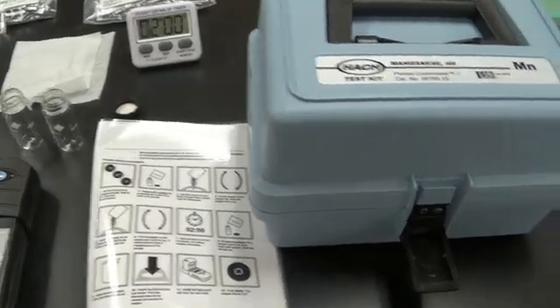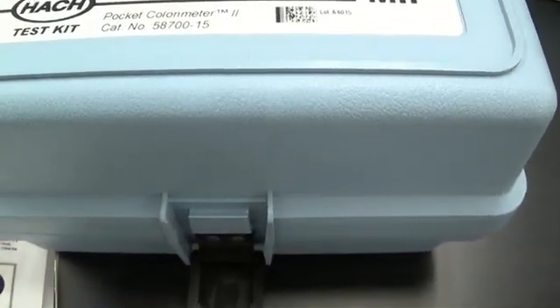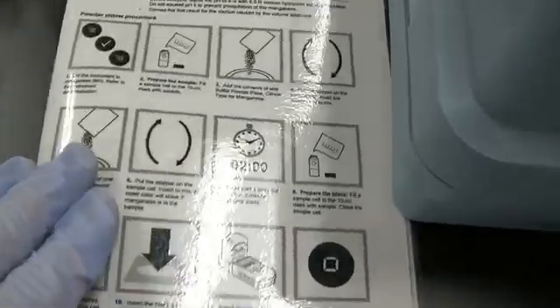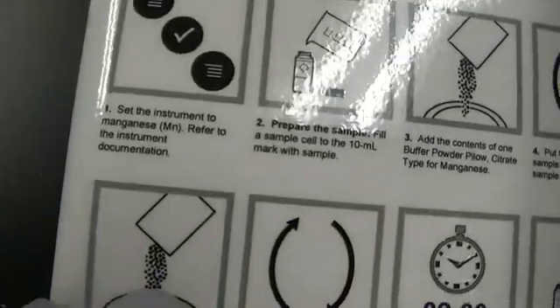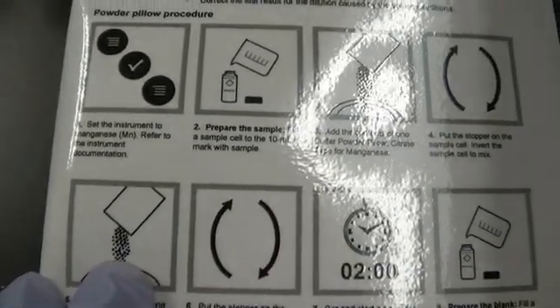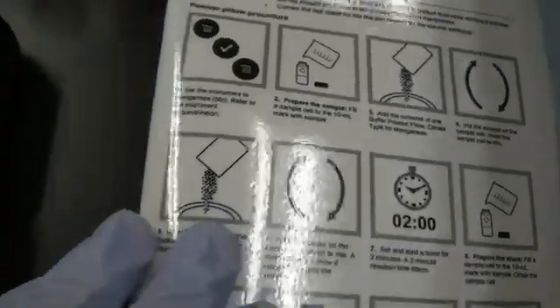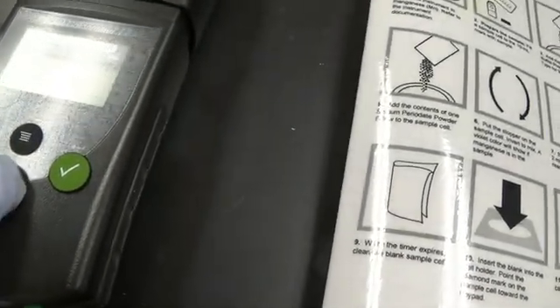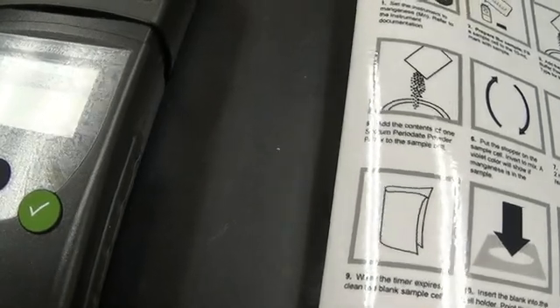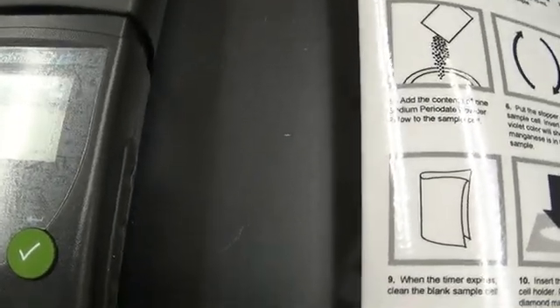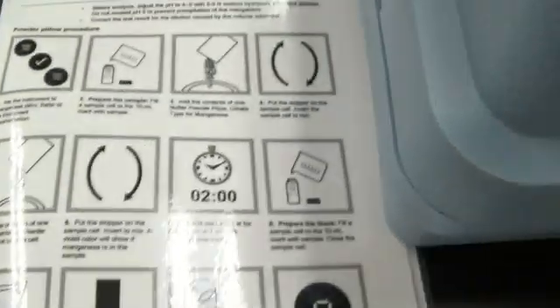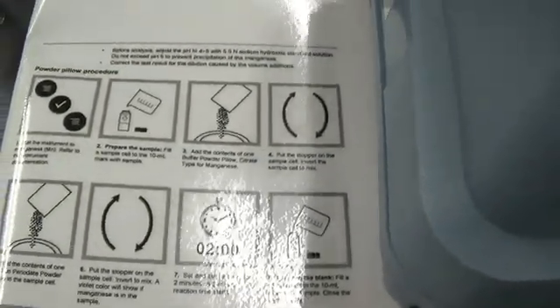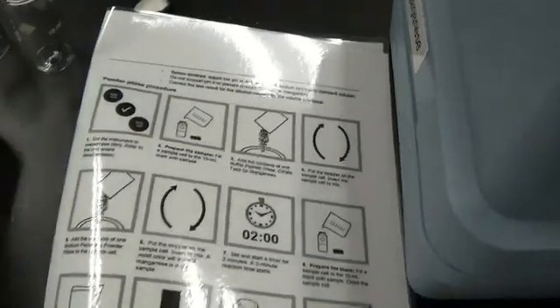I'm going to test my water using the manganese hock kit here. Check out the directions. Set up the instrument to manganese. Refer to the instrument documentation. There it is at milligrams per liter. Prepare the sample. Fill with 10 mils to the mark.